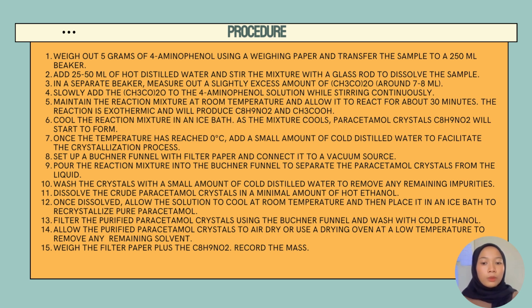Cool the reaction mixture in an ice bath. As the mixture cools, paracetamol crystals will start to form. Once the temperature has reached 0, add a small amount of cool distilled water to facilitate the crystallization process.